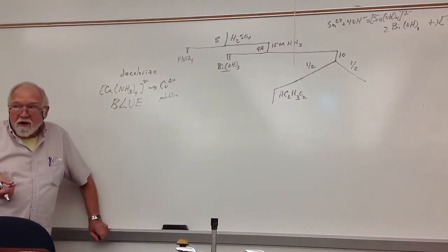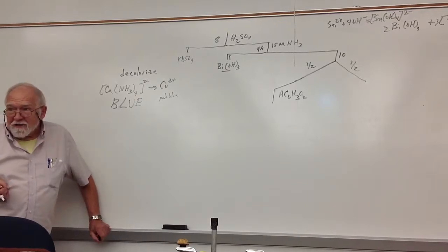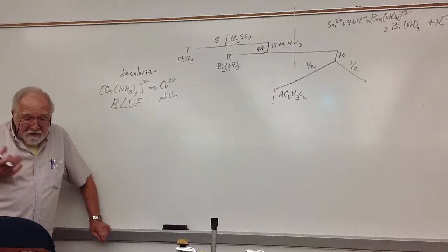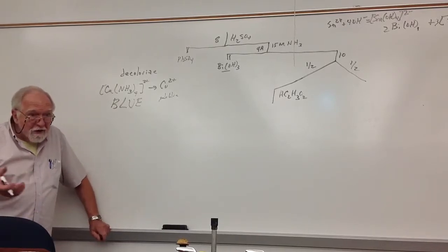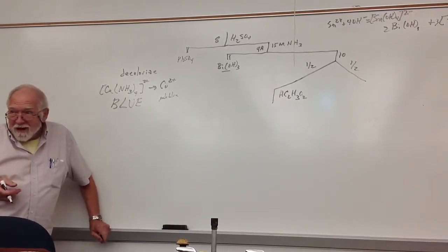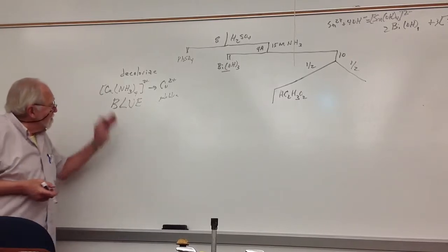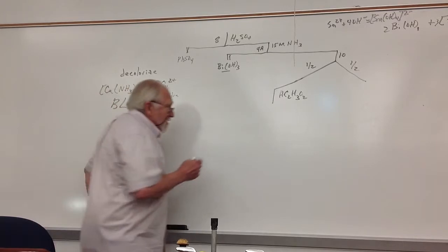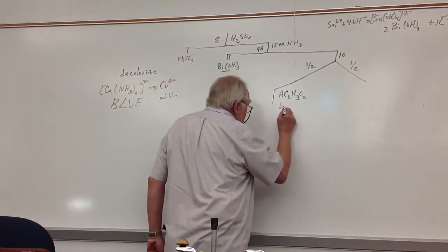What would be another way of deciding if you added enough acetic acid? Yeah, use litmus paper. And when you do your unknown, chances are you won't have copper in your sample, so you won't have a blue color to see the change. So the other thing is, you test the acid with litmus.